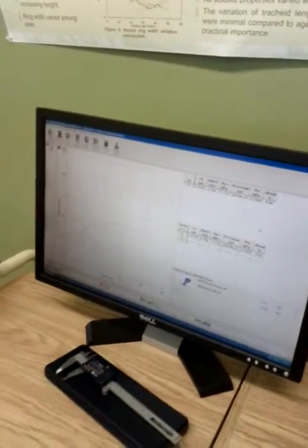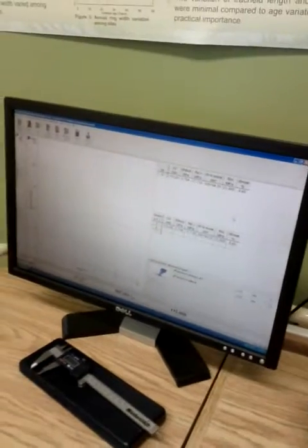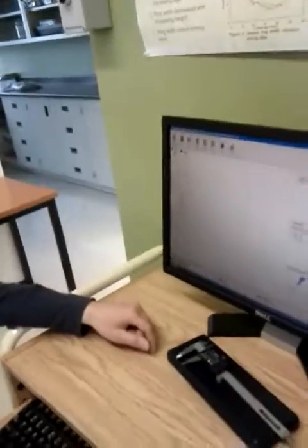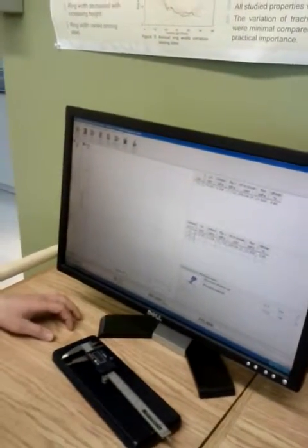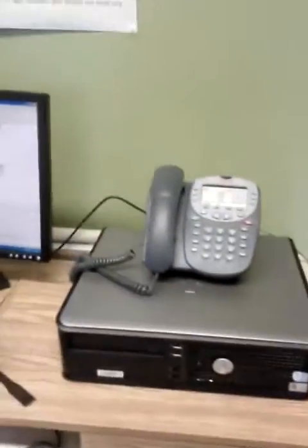So this is it. I suggest you remove all this and begin again while you're here, or you can begin your test. I don't think so, because I have a lot of things to do at once. So you prefer to work at once. I see. So this is it, I can save. Keep this file on the flash drive.